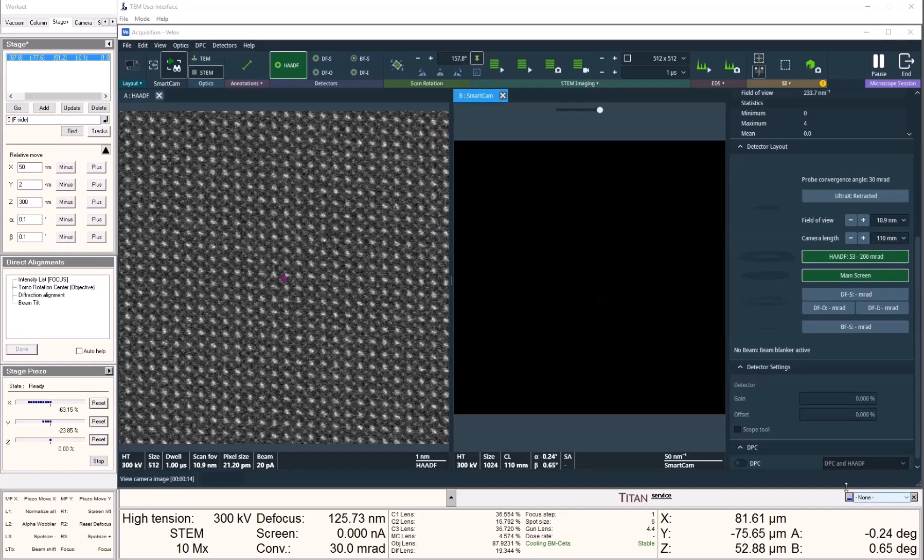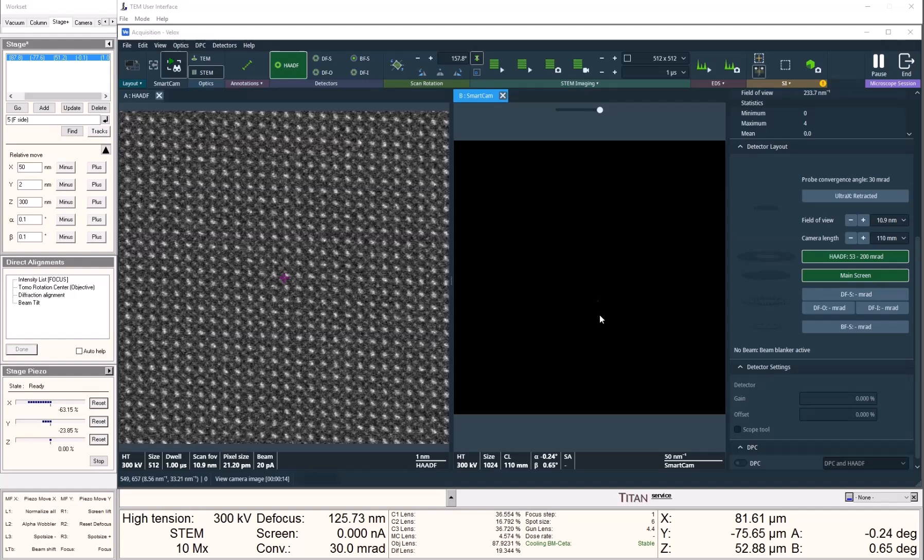One of the biggest advantages of using IDPC technique is to image light elements such as carbon, nitrogen, and oxygen. Usually, they don't appear very well on the regular HAADF detectors.